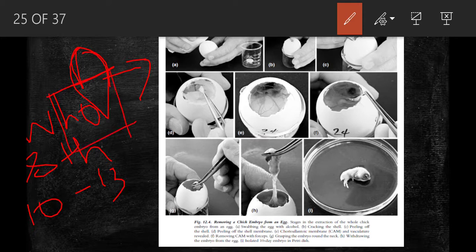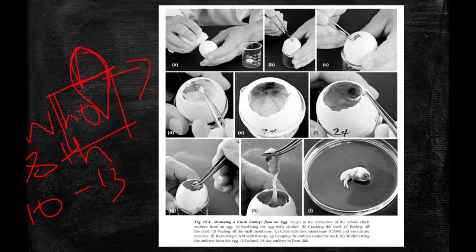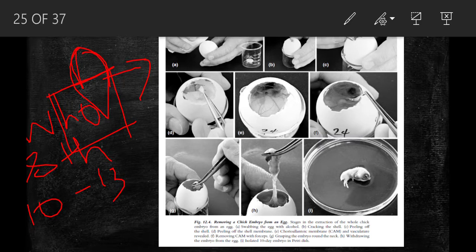After keeping the blunt end in the beaker, you have to crack open the top shell, peel off the shell, and you can see the air sacs at the edge.